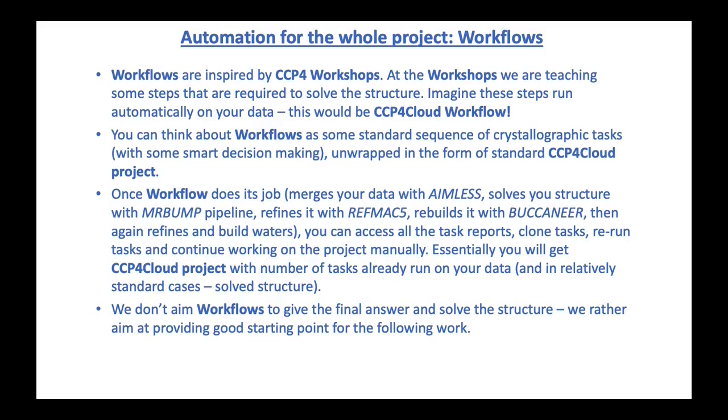So, automation for the whole project. It's called workflows. Workflows are in fact inspired by CCP4 workshops. At the workshops, we are teaching some steps that are required to solve the structure. And just imagine these steps just run automatically on your data. And this would be a CCP4 workflow.